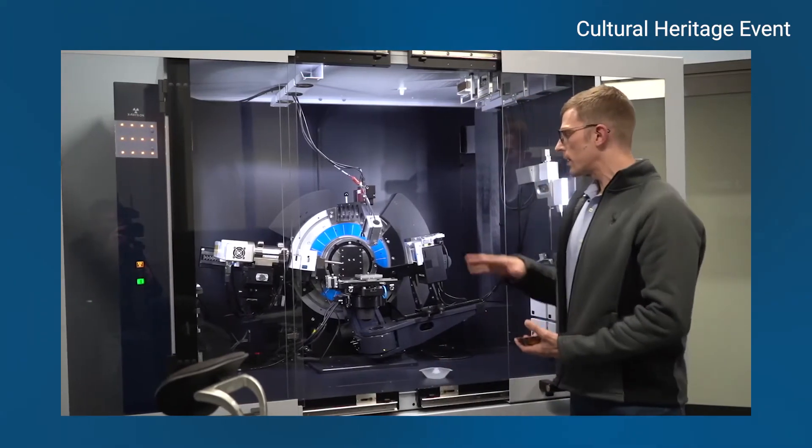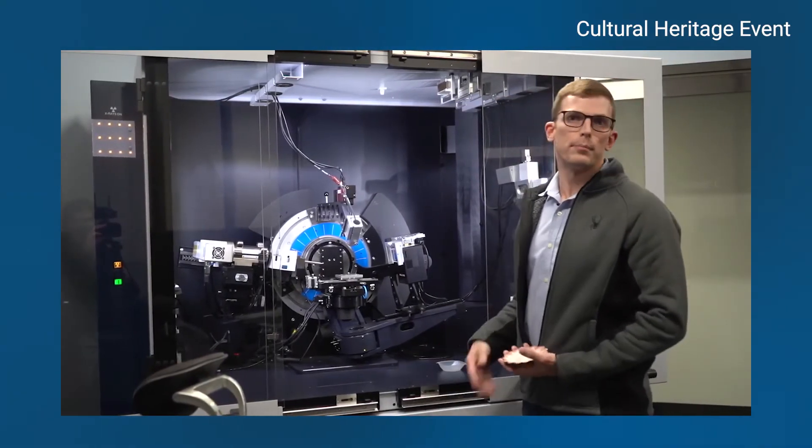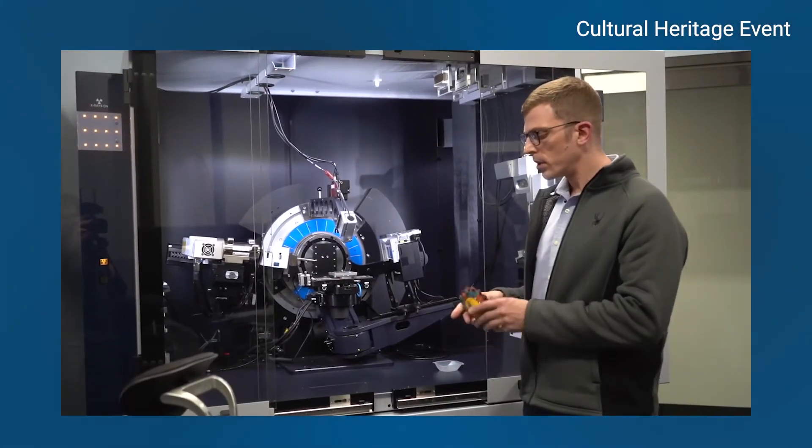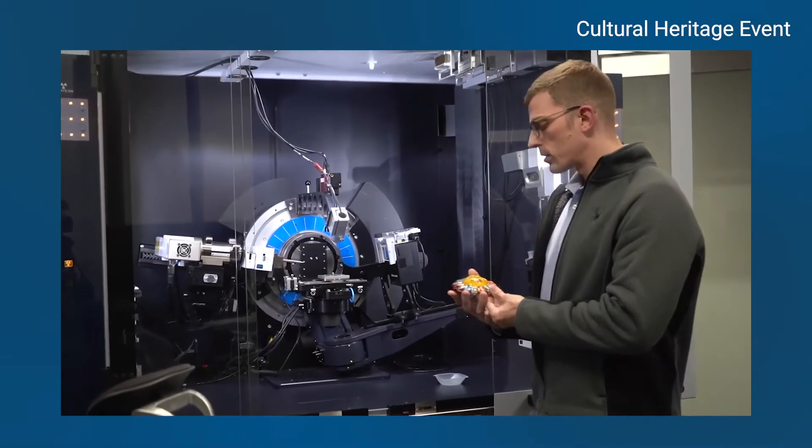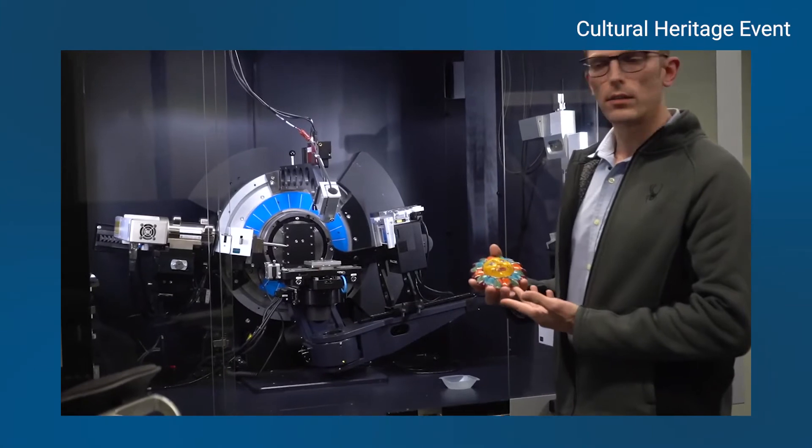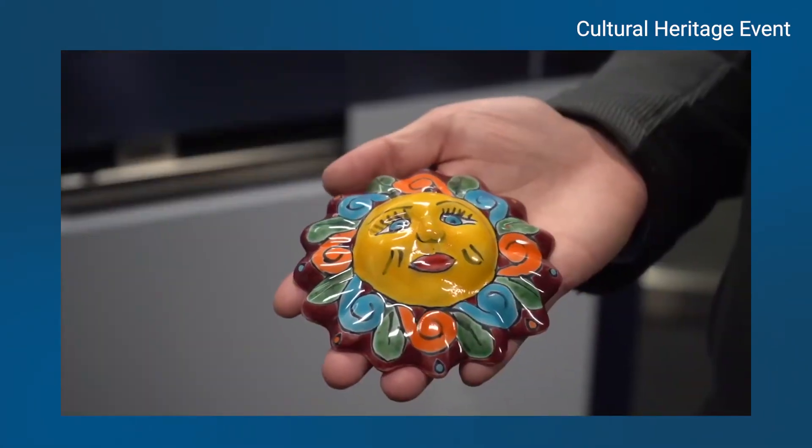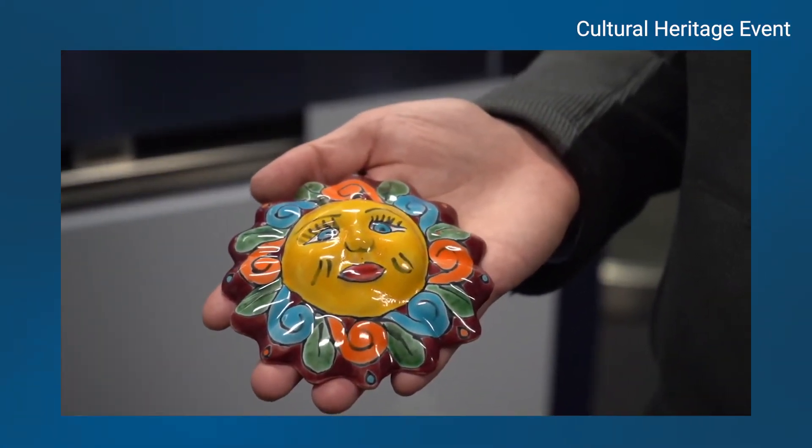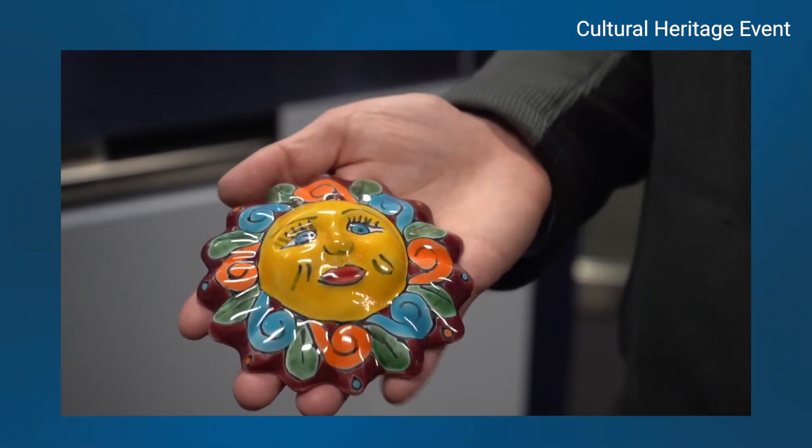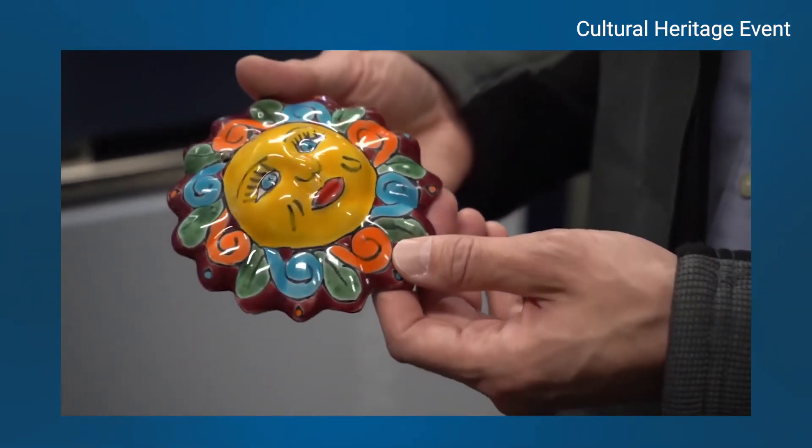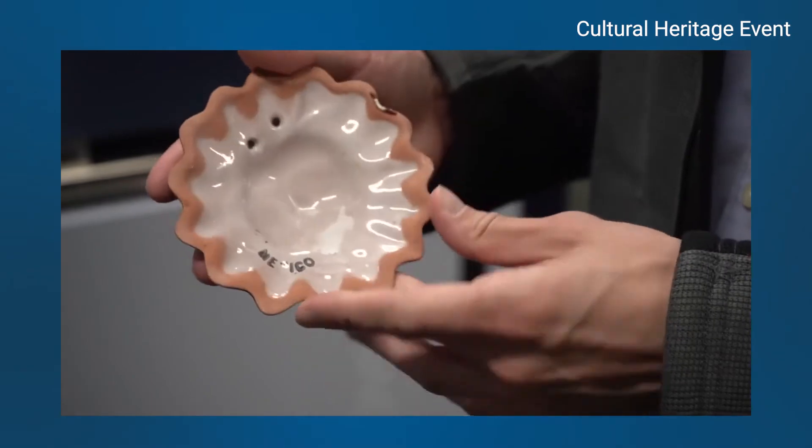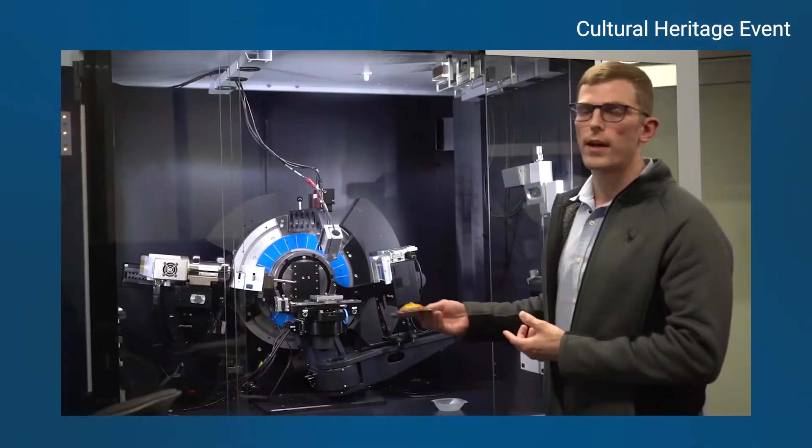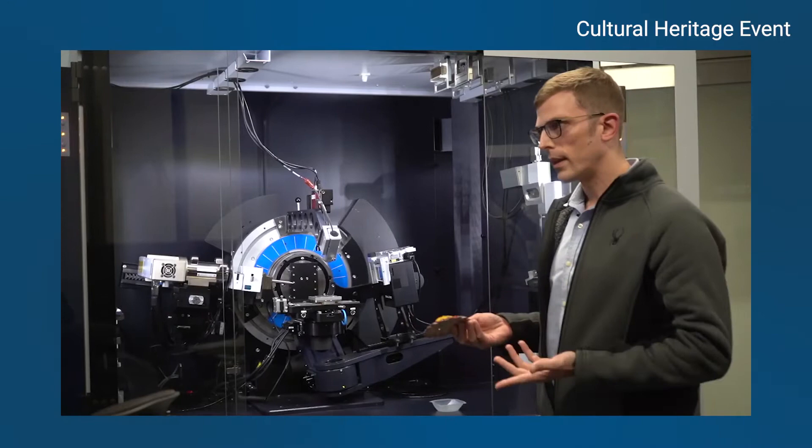Altogether it makes for a really simple to use platform for doing analysis on bulk artifacts, such as this ceramic art that we got from Mexico. You can target different regions on it, collect XRD, move to different regions, and do it all non-destructively. You don't have to grind anything down. Just plop it on, drive it to the position you want to measure, and go.